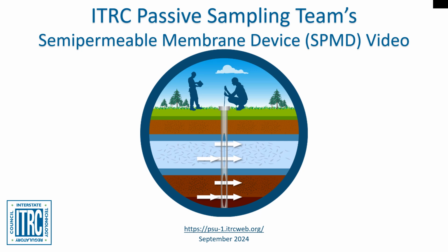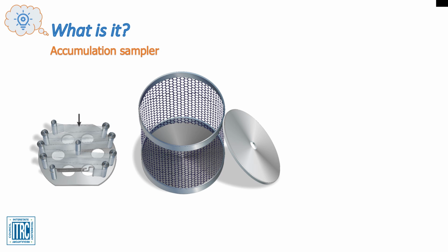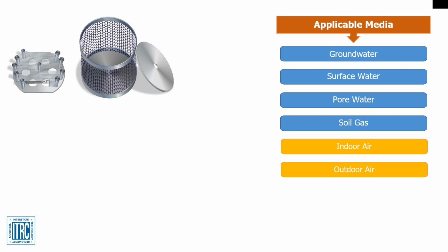Guidance document. The Semi-Permeable Membrane Device, or SPMD, is an accumulation-type passive sampler that accumulates chemical mass over time while deployed. The SPMD primarily collects samples in groundwater, surface water, pore water, and soil gas. The device can also be deployed to collect ambient air samples both indoors and outdoors.